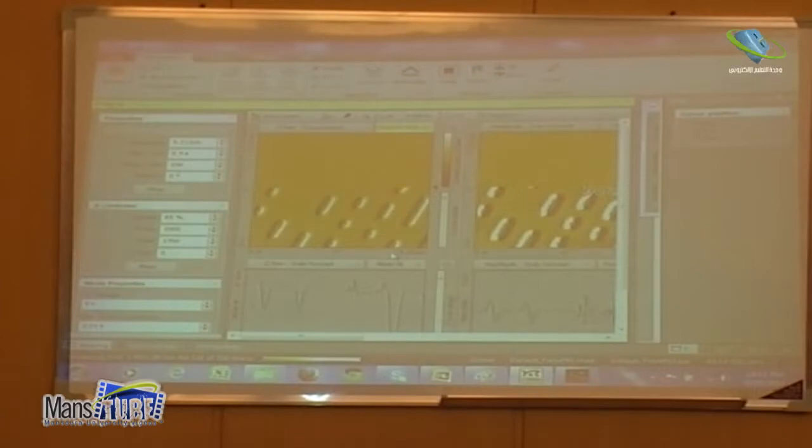What I can do now is zoom in on the logo to make it bigger to see it. So I make zoom, and then double click. Then I will zoom inside, and then you will see the logo big. If you want to make the logo of the university, first you make the design with the GDS file, and then you import it. Or your photo? Yeah. Okay.